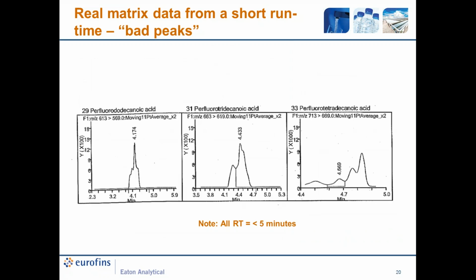Another example of quantitated, poorly resolved peaks. Notice in these examples, the time is all less than 5 minutes.